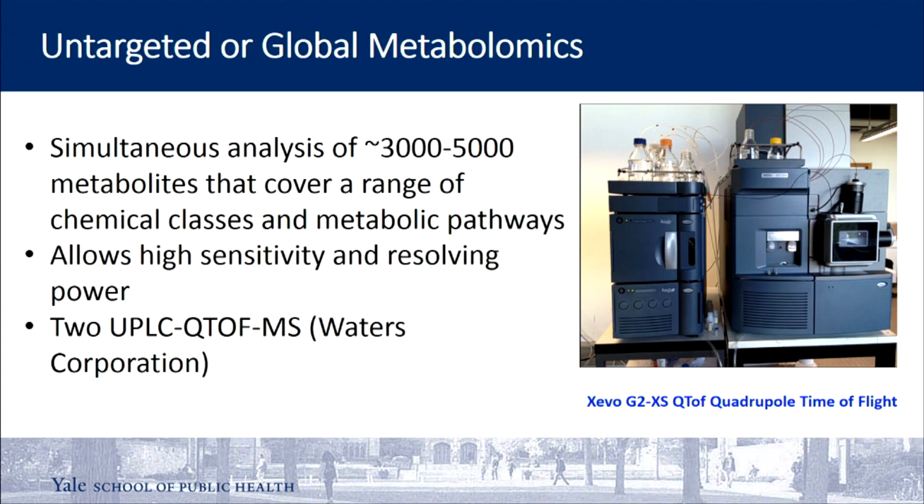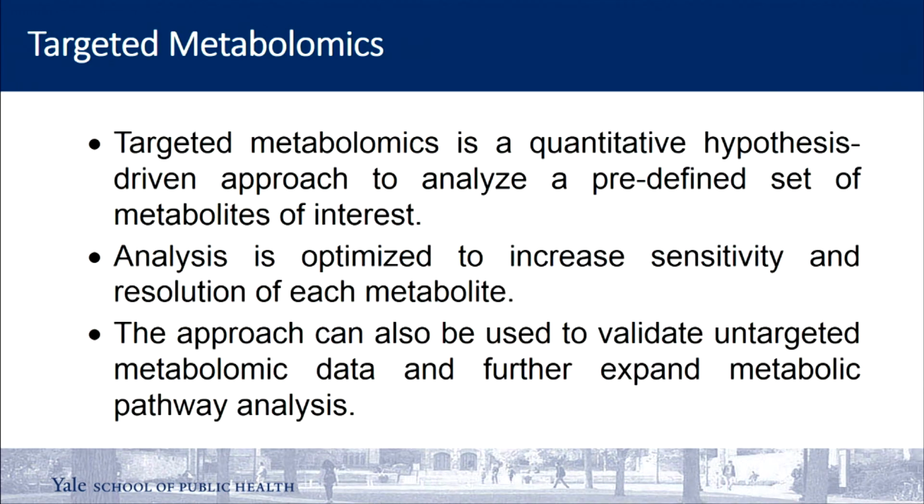Untargeted metabolomics, especially when you're using highly sensitive hardware, allows for high sensitivity and resolving power. In our department, we have two UPLC instruments from Waters, and we just got another one from Thermo, which is a high-resolution machine that allows us to go to even higher sensitivity.